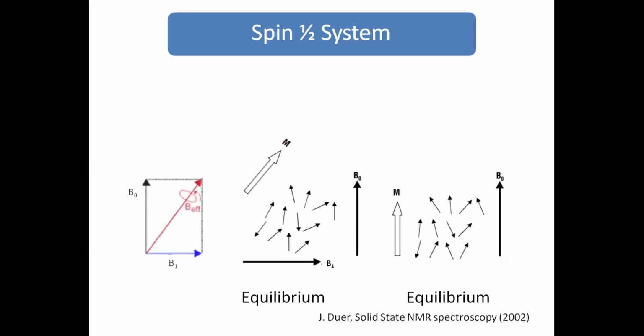This change is carried out with the help of an RF pulse that is generated through the computer system attached to the NMR spectrometer, and that can be calculated theoretically, and then we apply it depending on the system. For proton, for example, we apply this and we get a signal by shifting the equilibrium at 90 degrees to the z direction in which the static magnetic field is applied.